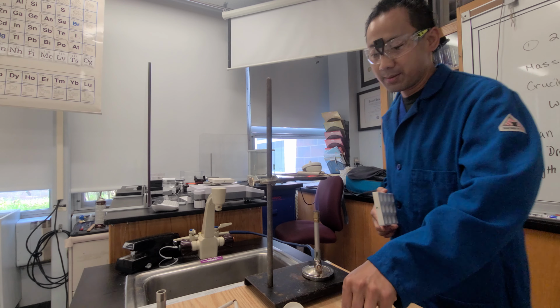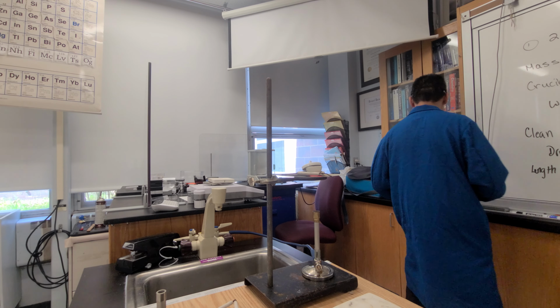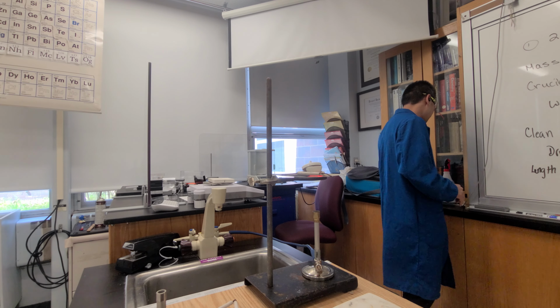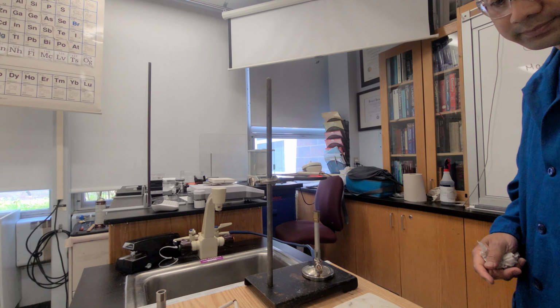And we're going to take this and put it down here just in case. I'm going to get any of the other crucibles out of here, just so that I don't get confused. Magnesium strips out of here as well. Okay, so those are my spares. So I think I'm good to go.